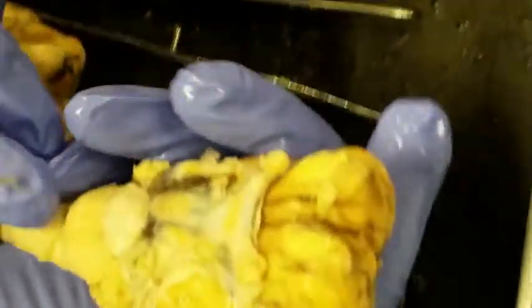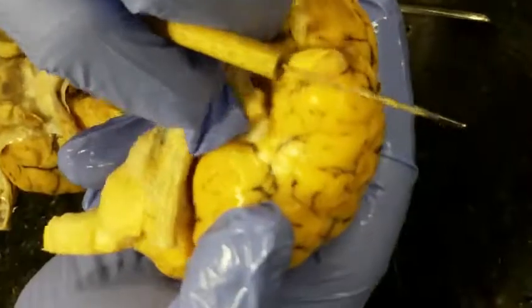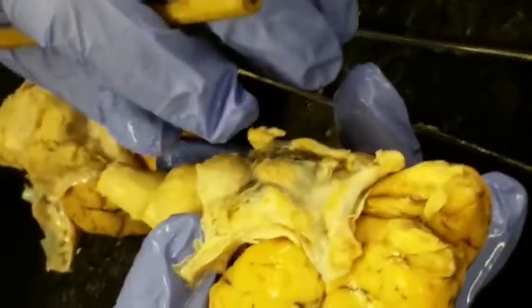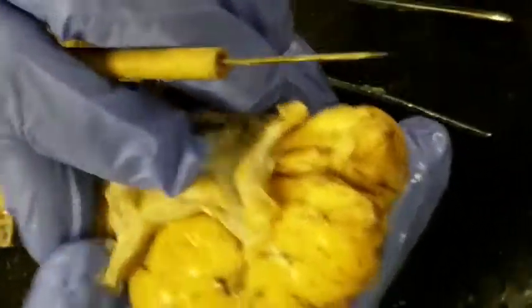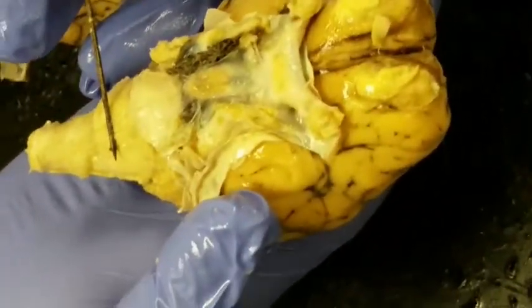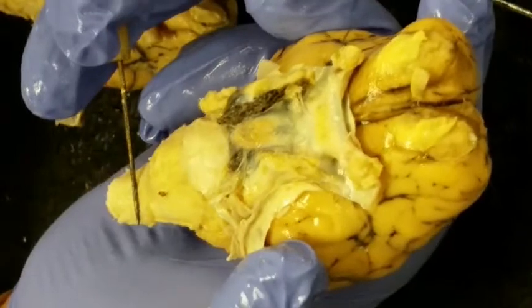Let's put it back together. And we can actually pull this off. Be very gentle. That is part of what? It looks like tofu. The innermost covering. Dura mater? The pia mater. Yes, pia mater. Okay, so this mound represents what? The pons. And this is the medulla oblongata.